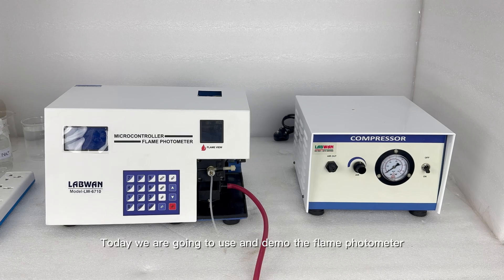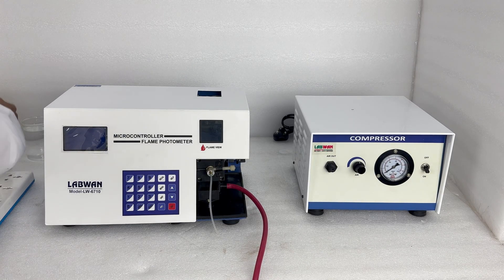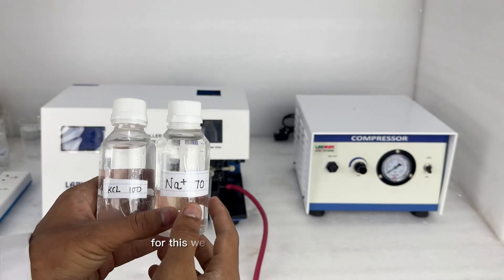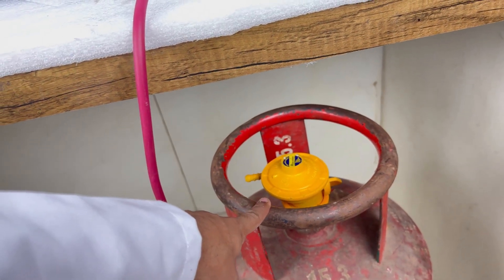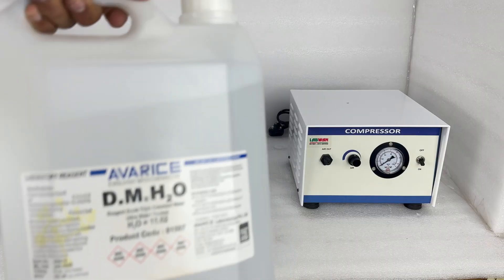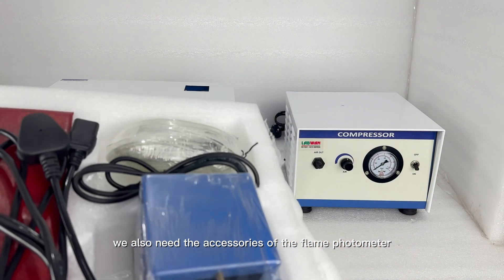Today we are going to use and demo the flame photometer. I have the instrument with a compressor. To use it, we will need standard solutions — I have solutions of sodium and potassium. We will also need a gas cylinder, distilled water, and the accessories of the flame photometer.